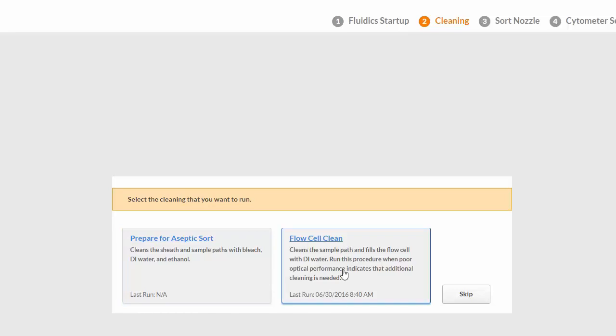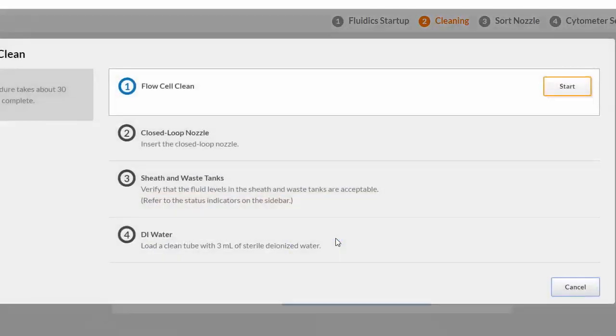Flow Cell Clean will clean the sample path and fill the flow cell with deionized water. We recommend running the flow cell clean between samples or different operators. For this demonstration, we will perform a Flow Cell Clean.